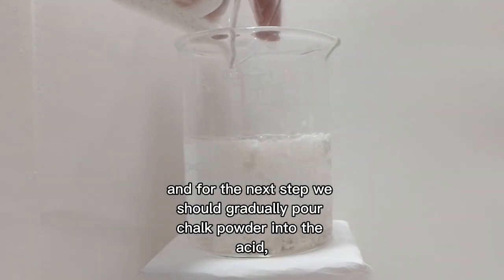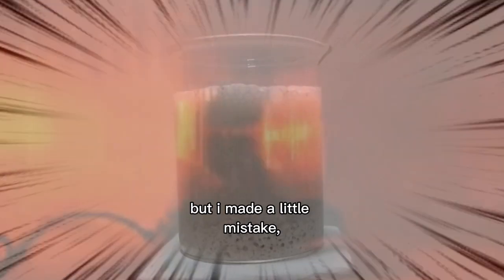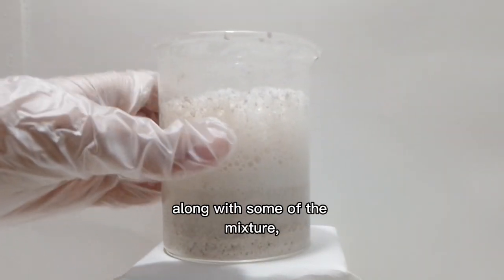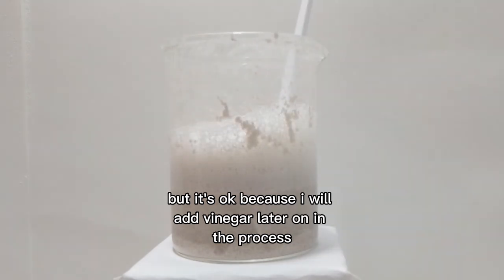For the next step, we should gradually pour chalk powder into the acid. But I made a little mistake — it quickly overflowed and I had to throw the bubbles in the sink, along with some of the mixture. But it's okay because I will add vinegar later on in the process.